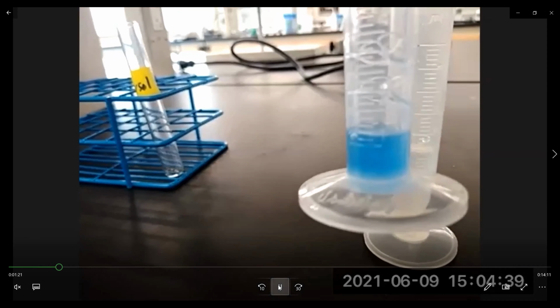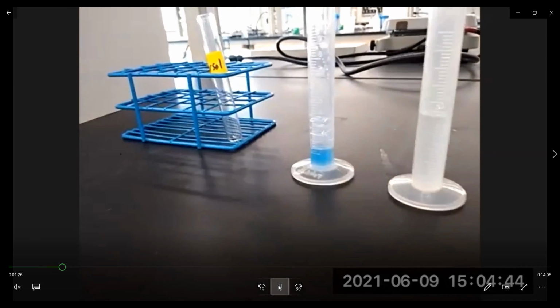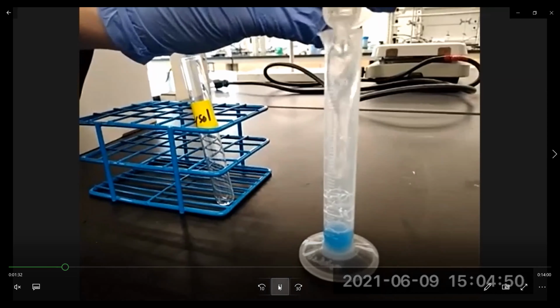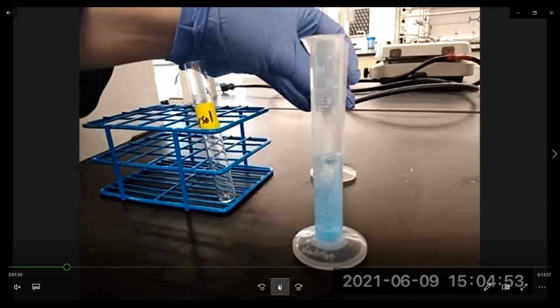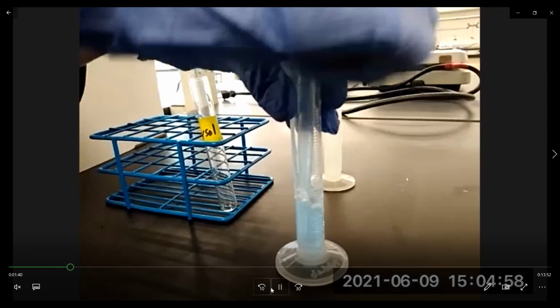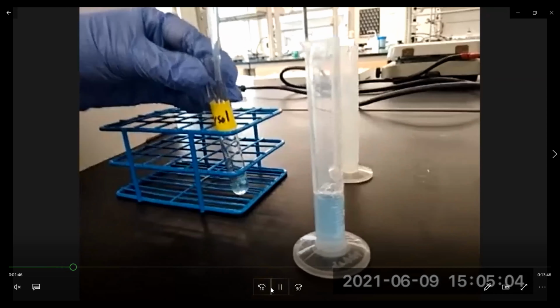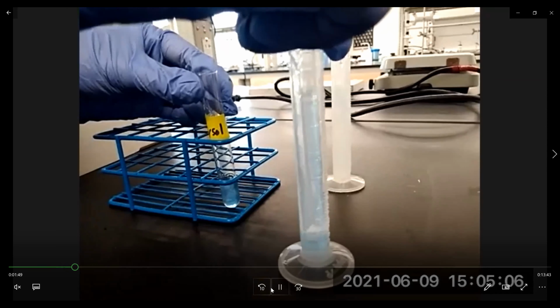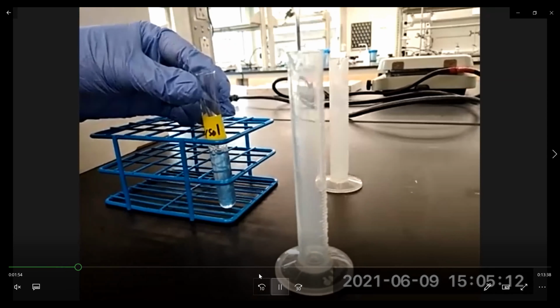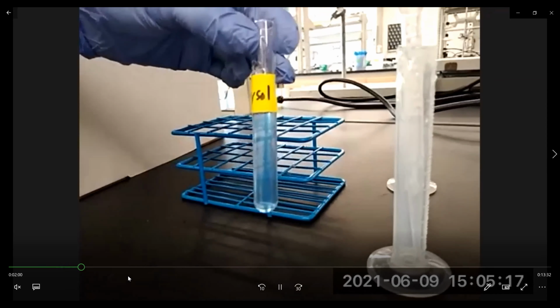So Lysol is a blue solution, and it gets kind of soapy as well. So we're mixing the water with the Lysol. And this is what we're going to use when we test the reactivity of Lysol, this dilute solution. So Lysol, that's how we prepare the solution.